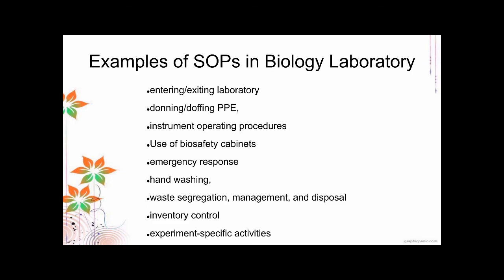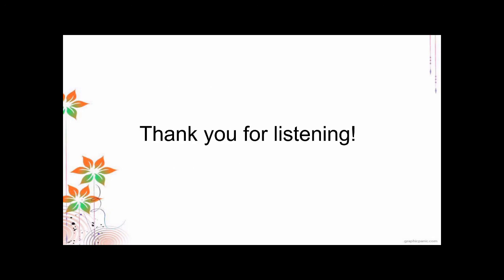Aside from that, there must be standard operating procedures specific for certain analytical techniques or experiment-specific activities. So that's it for this part of the lecture.